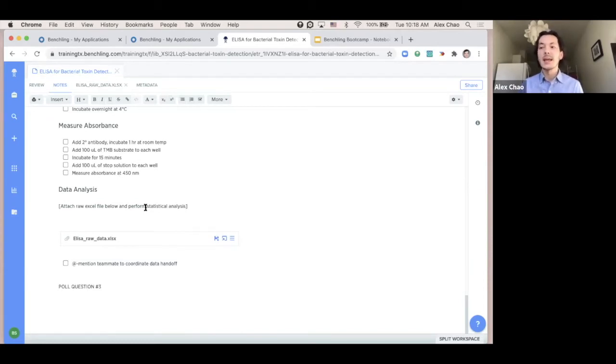Multiple folks would make edits to this Excel spreadsheet and then not share these edits, or we would end up having different versions of the Excel sheet depending on who was editing this. So essentially there wasn't a central source of truth for our spreadsheet, and this caused miscommunication as well as other issues with maintaining this data.